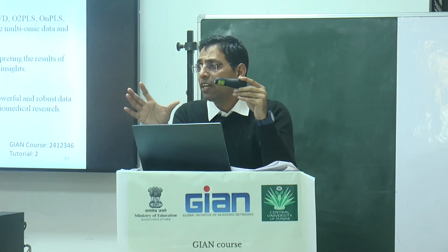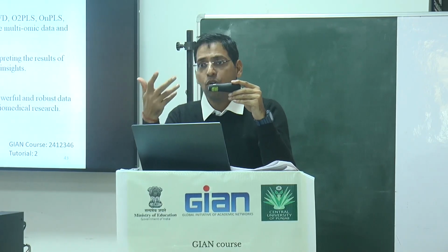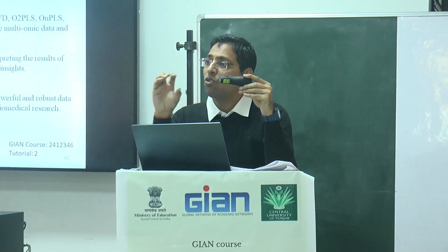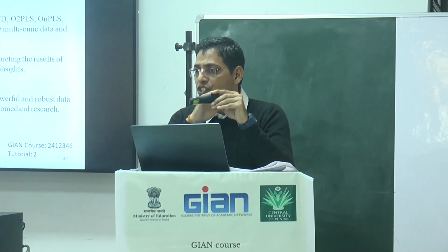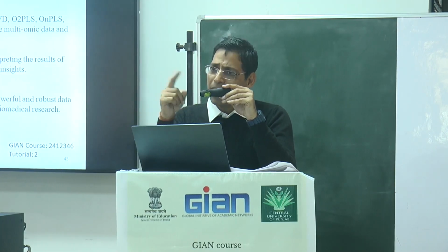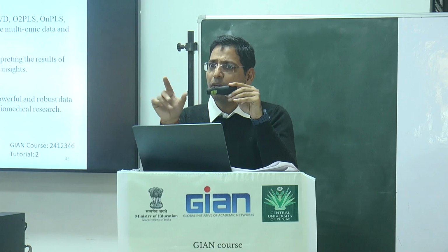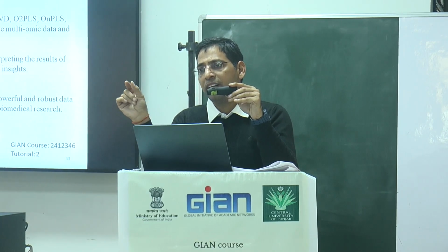More theoretical plates means more validation, more checks. More checks means it comes after some time with the pure amount. Now holding of those analytes by those solutes, if they hold too much, we change the solvents, and it will come out. So there are many parameters. I can't say that it is one reason. There are multiple reasons which are responsible for getting one retention time different from another retention time in another experiment.